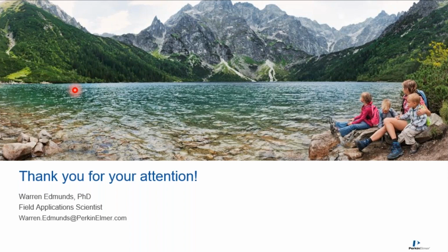Okay. Had another user question. Does a liquid sample need to be particle-free?